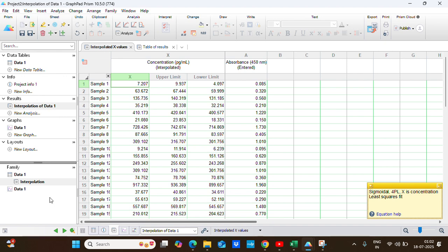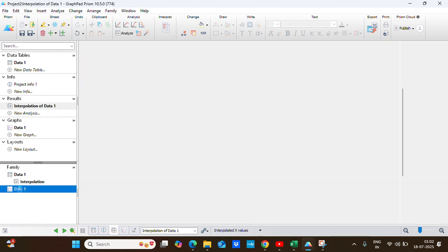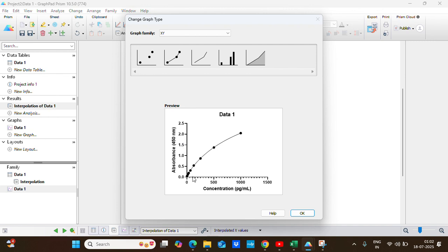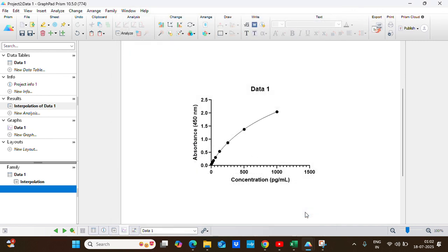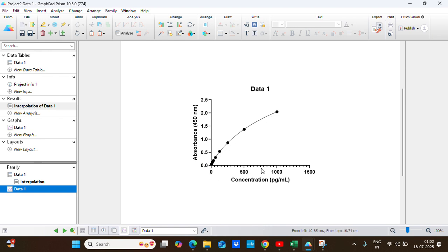Now GraphPad Prism automatically gives you the graphical representation. This is the graphical representation of the values of the standard concentration and their absorbance value.